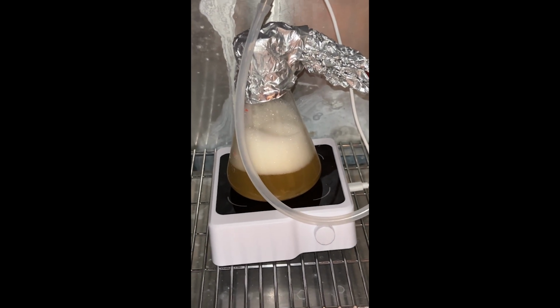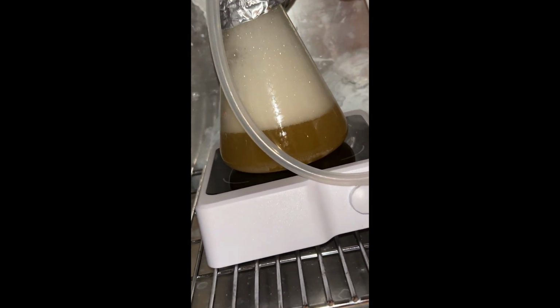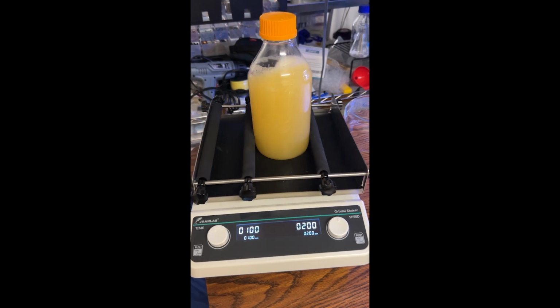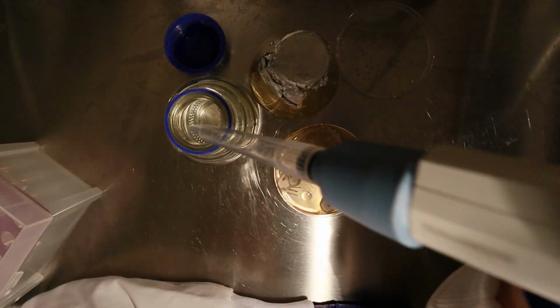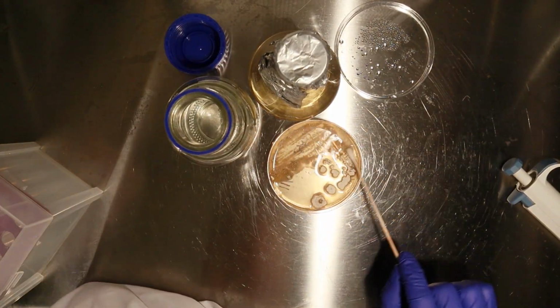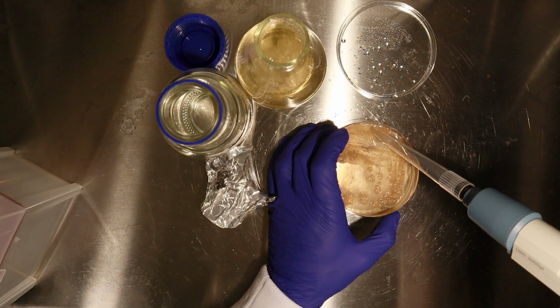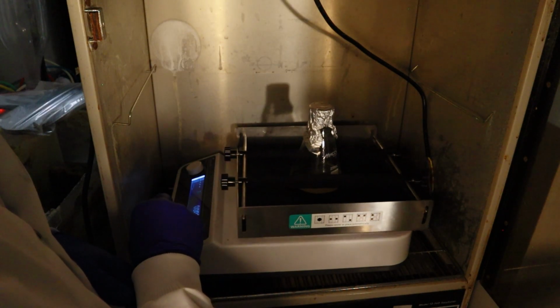I had tried doing this with just an autoclaved air stone and a magnetic stirrer, but it failed catastrophically when the media bubbled out of control. I bought both an orbital shaker and an incubator big enough to hold both, so now I can finally inoculate my flask. I added 5 ml of sterile distilled water to a plate of Streptomyces and mixed the spores into it with a sterile applicator swab. I then tilted the plate and pipetted out 5 ml of culture liquid and into the flask. I then secured the flask to my orbital shaker and let it incubate for 2 days.